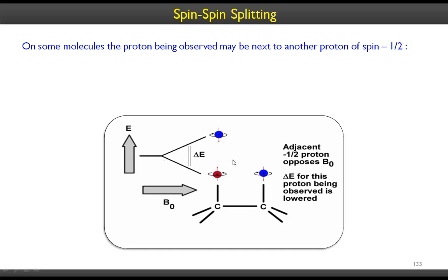It's pretty complicated if you don't get it. I'm also trying to simplify it in the process. I'm not sure whether it's confusing you. What I mean to say is NMR is a collected average depiction of quite a few data points. It's not derived from one molecule. It's obtained from thousands of millions of these molecules in the sample.